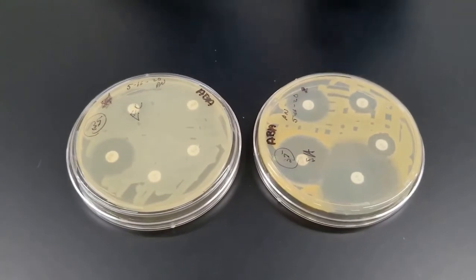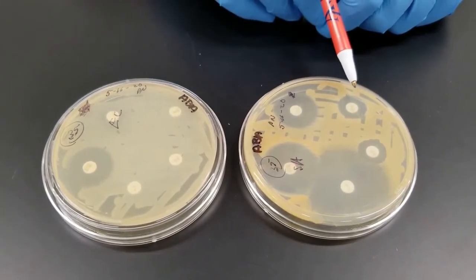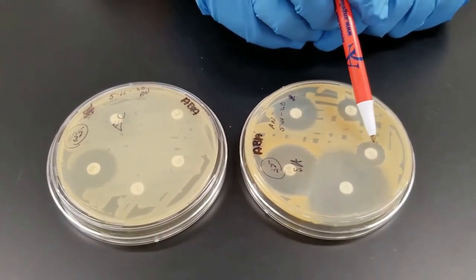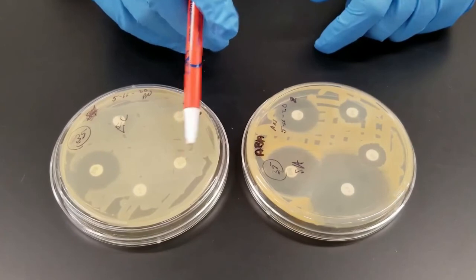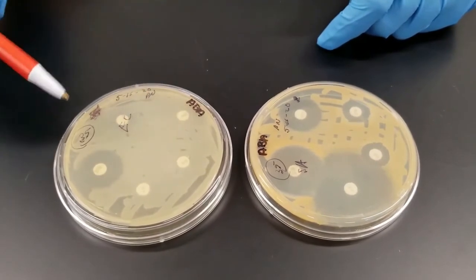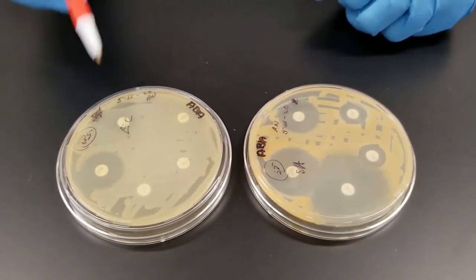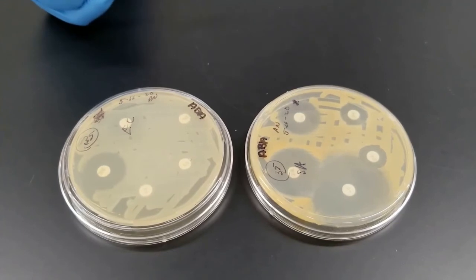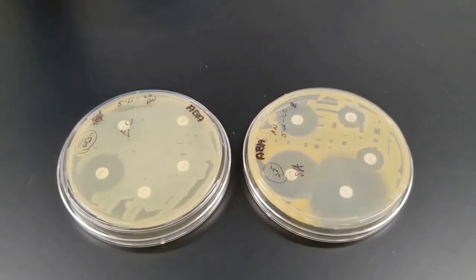Now, if we look at the various antibiotics and we compare between the two, starting over here, this is Bacitracin. It was inhibitory to Staphylococcus aureus, but not E. coli. This is vancomycin. Once again, was inhibitory to the Staph aureus, but not to the E. coli. Penicillin was effective against Staph aureus, but not against the E. coli. Tetracycline was effective against both the gram-positive and gram-negative, so that would be considered or classified as a broad spectrum. It is effective against multiple different types of bacteria, whether it's gram-positive or gram-negative.